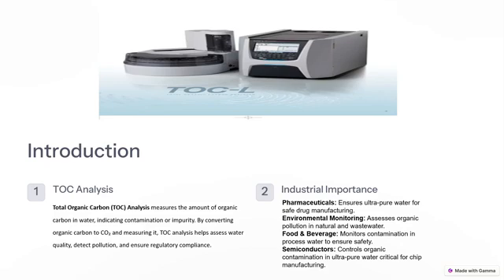So, TOC analysis is crucial for ensuring safety, maintaining product quality, and achieving regulatory compliance in these industries. With this understanding, let us move forward to explore how a TOC analyzer operates.